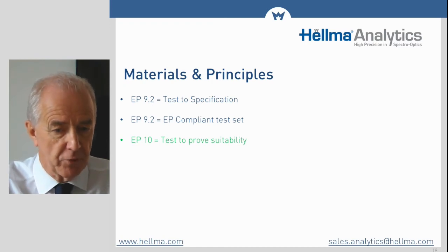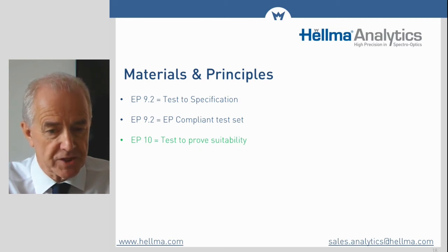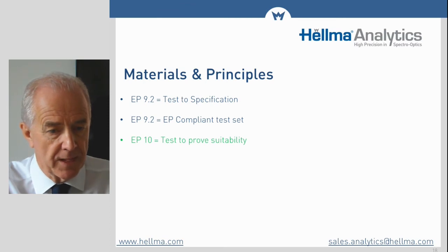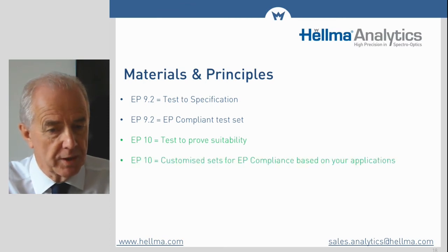This means that the performance of the spectrometer has to be validated against the requirements of every application carried out on it. So no single filter set will meet all requirements. Personalised filter sets suitable for all your regulated applications will be needed, and it will become impossible to add an application for which the spectrometer has not been checked as fit for purpose.